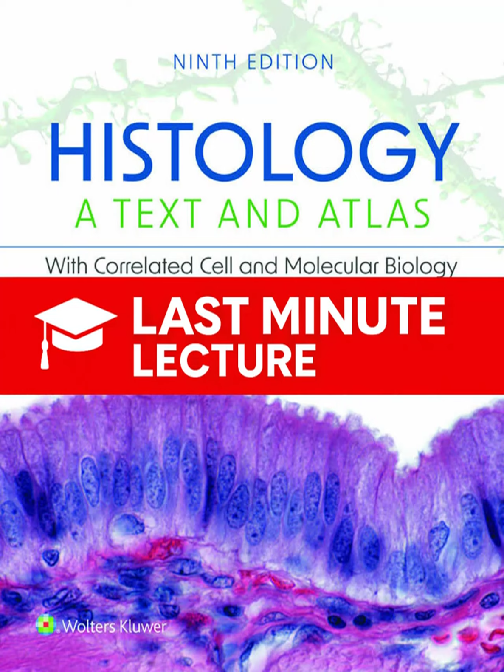Fixation. So that's basically preserving the tissue's blueprint. What happens if you don't fix it, say, right after it's removed? Well, it starts to degrade almost instantly. So the fixative, the chemical you use, has to do 4 critical things right away. Okay, what are they? 1, it has to stop all ongoing cell metabolism. 2, it prevents enzymatic degradation, a process called autolysis, which is just self-digestion. 3, it kills any potential pathogens. And 4, maybe most practically, it hardens the tissue. It makes it rigid enough that you can actually slice it without it just falling apart.